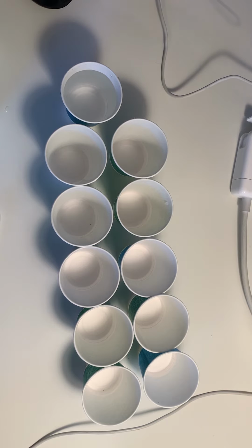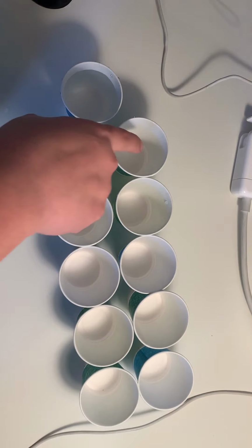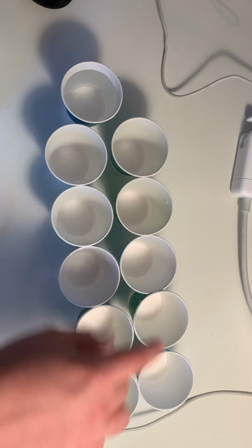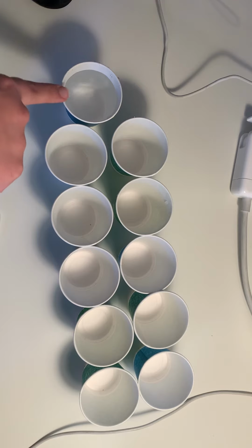What it tells you to do here is to take an ice cube tray and have 10 cells. Now I don't have an ice cube tray here at home, but I have these little Dixie cups, so I'm going to use that. I'm going to start with cell number 1 right here, and it's going to loop down to 5 at this end, and then this will be 6 and back to 10. This one is just full of plain water that I'm going to use as my solvent.